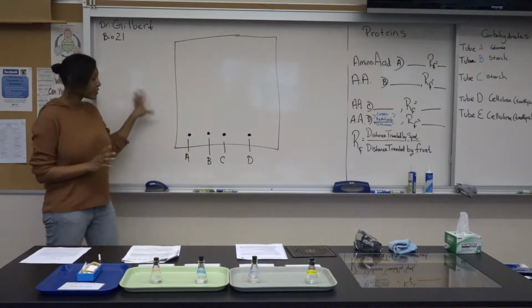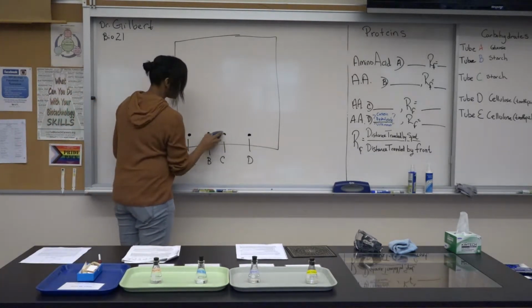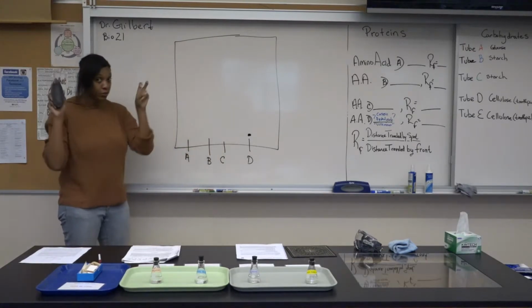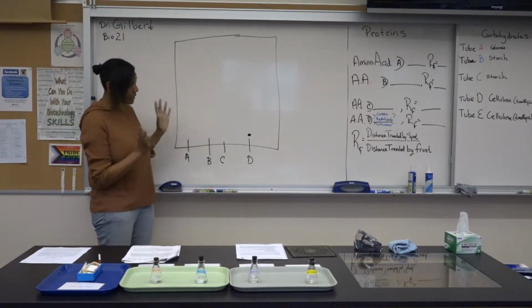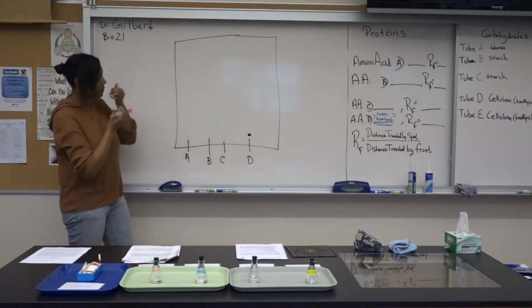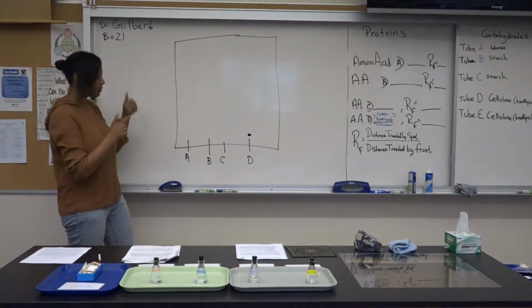So this one. Okay, so to illustrate how to deduce what is making up our unknown amino acid, which we're calling D, or casein hydrolysate, let's illustrate how these amino acids will go up our chromatography paper.